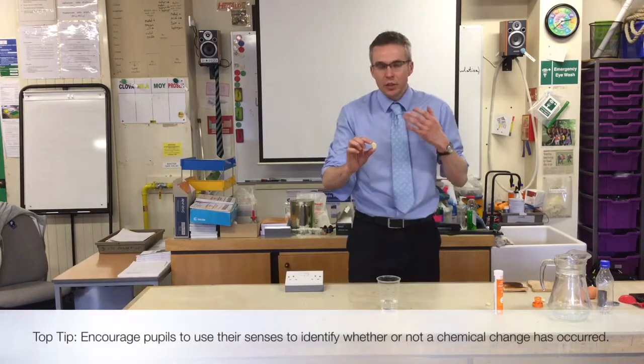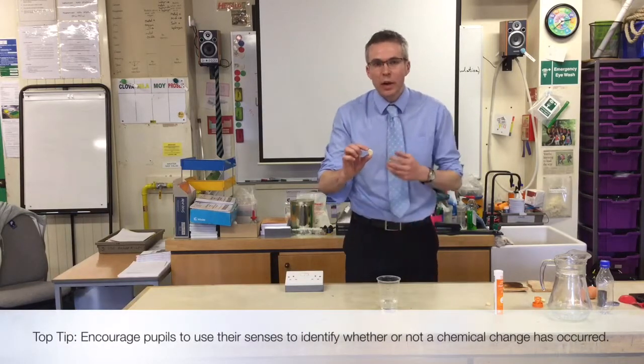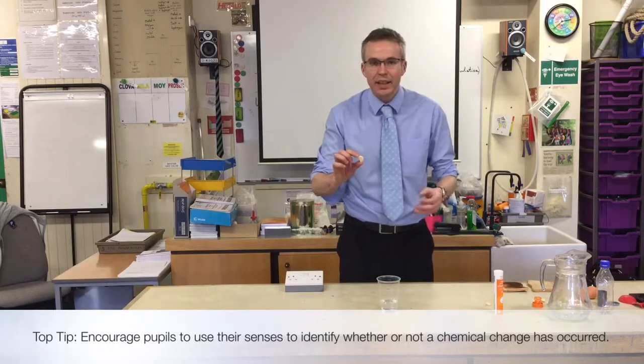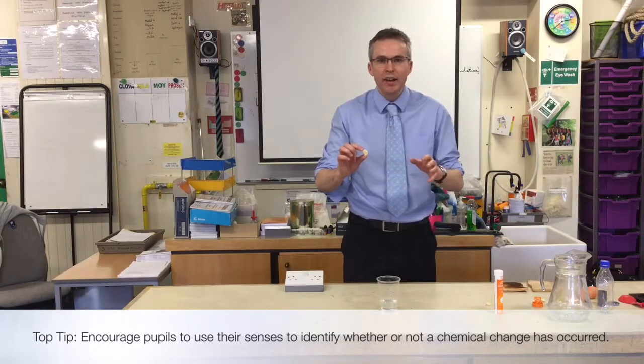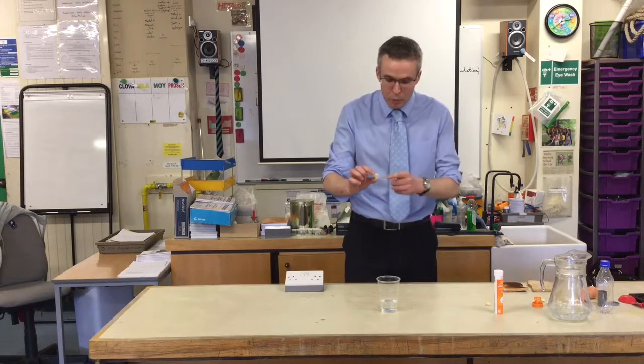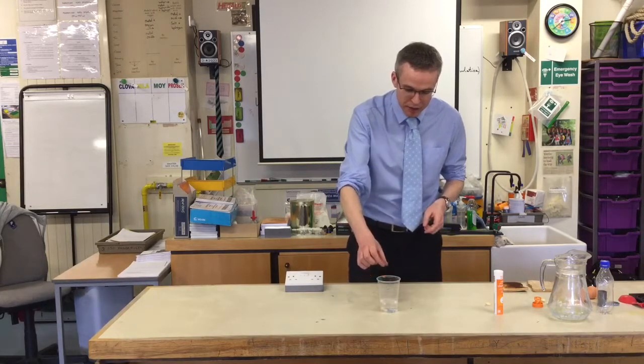So to use their eyes. What do they see when the tablet goes into the water? What do they hear? Do they smell anything? And those might give an indication that a chemical reaction is happening. So we'll put this in just to see what happens.